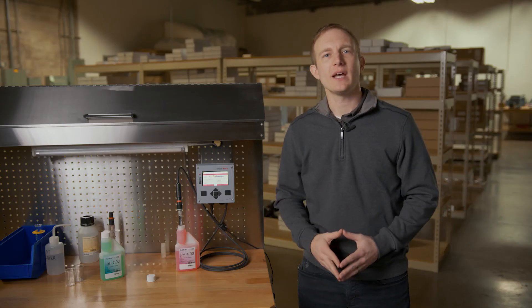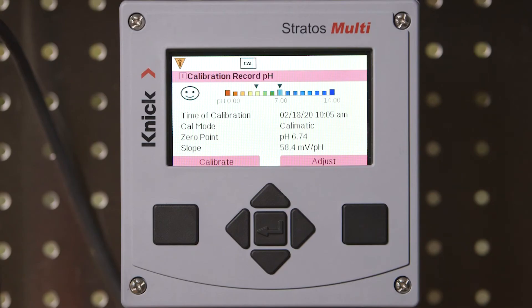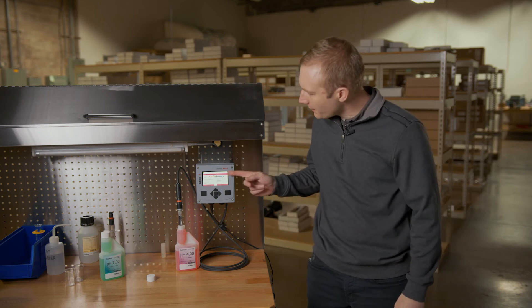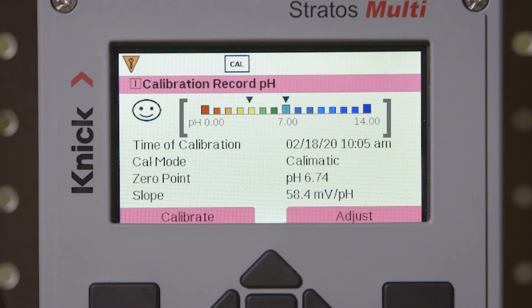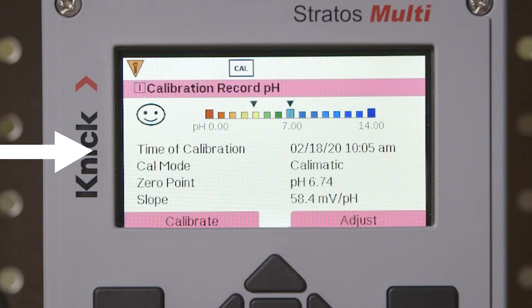Once complete in the second buffer solution, our Stratus Multi now displays the specifics of our calibration record. A pH chart at the top of the screen indicates the two buffer values that were used, 4 and 7. Next, we have a timestamp of our calibration, followed by the type of calibration that was performed, as well as the specific values of our zero point and slope of our electrode.